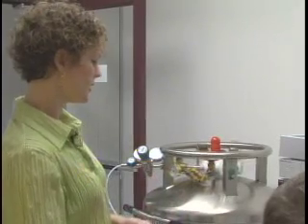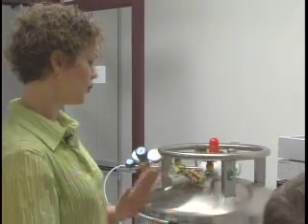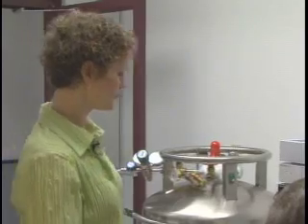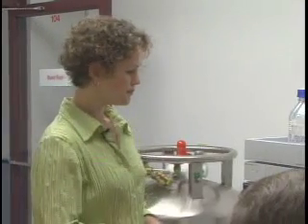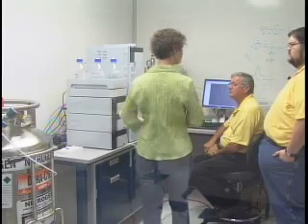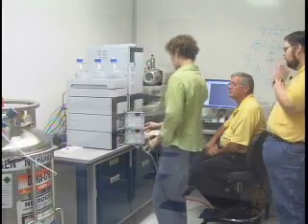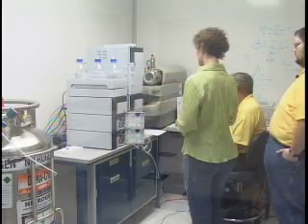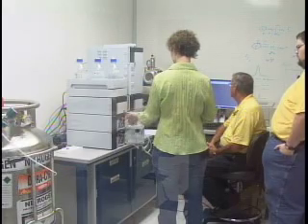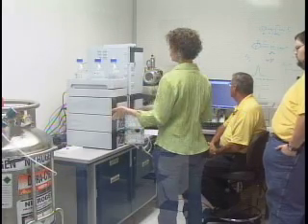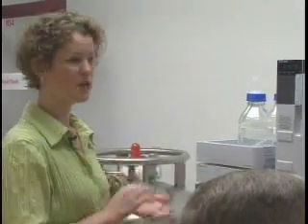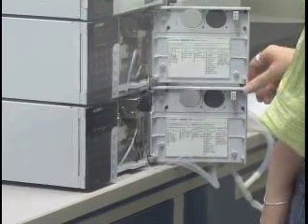In this particular system we've got two pumps — one for the aqueous and one for the organic. In these systems you can see the purging valve right here, which helps you when you're changing out your mobile phases. You want to make sure you get rid of any air bubbles in your system, as those can cause poor retention time standardization.